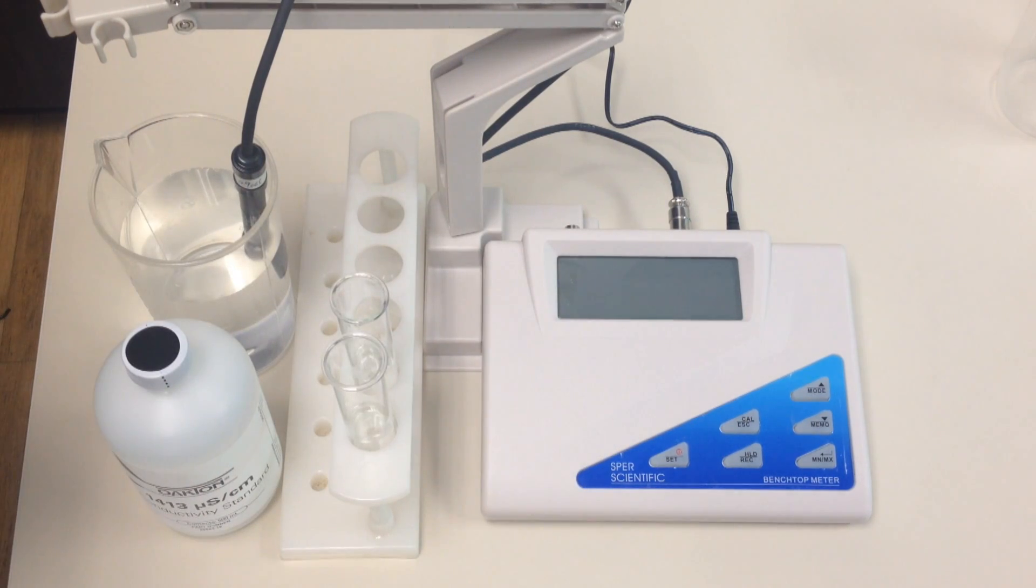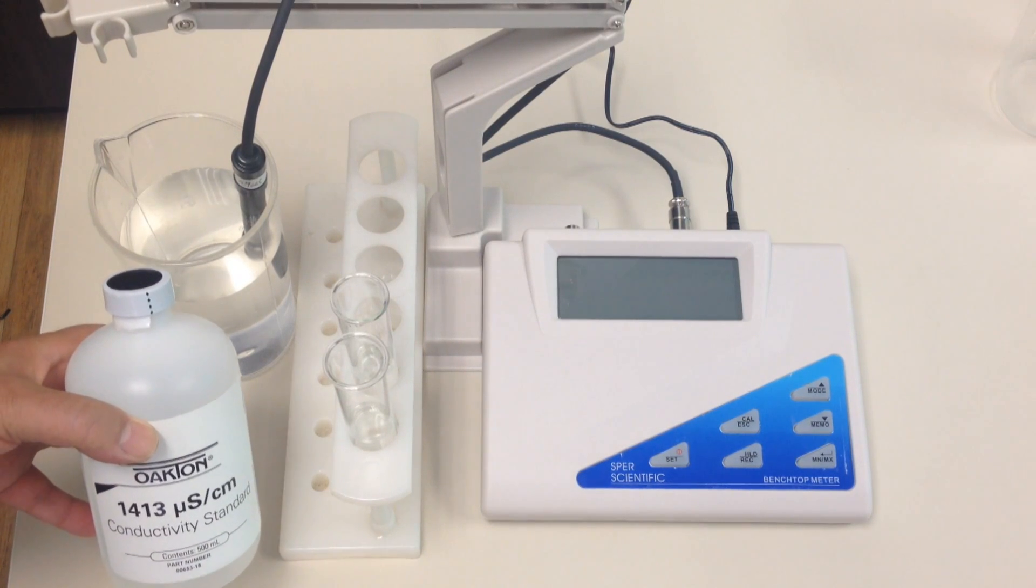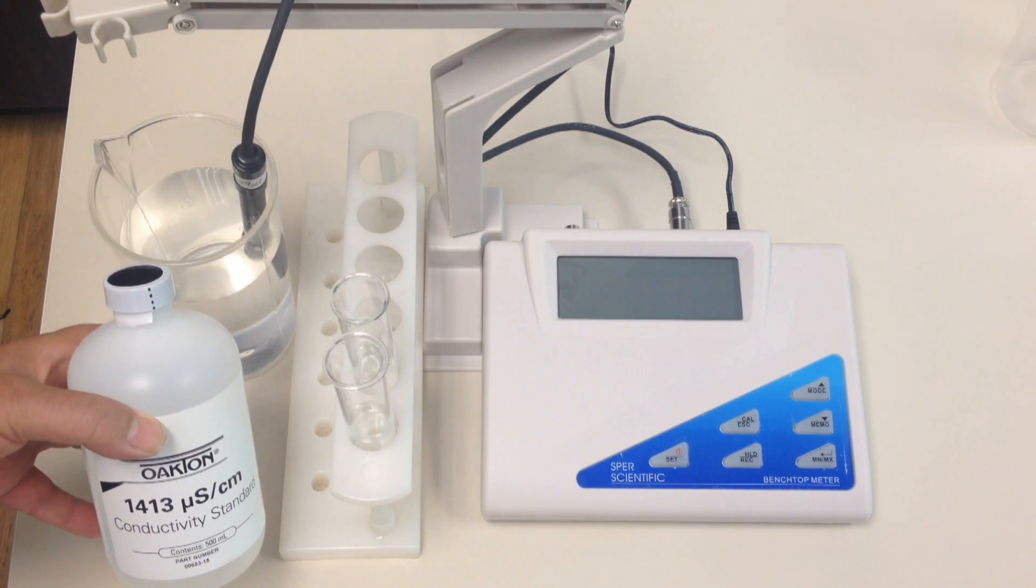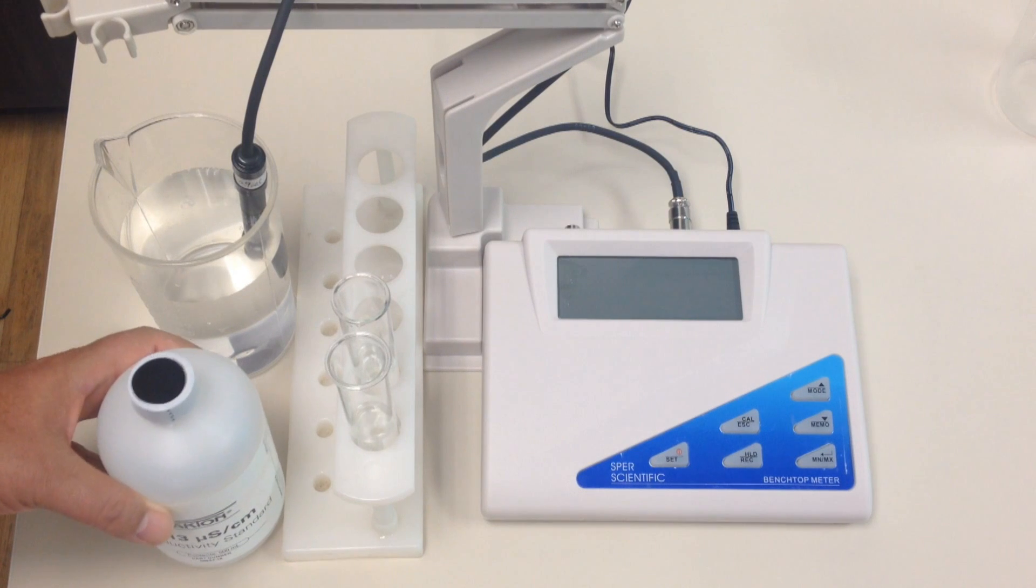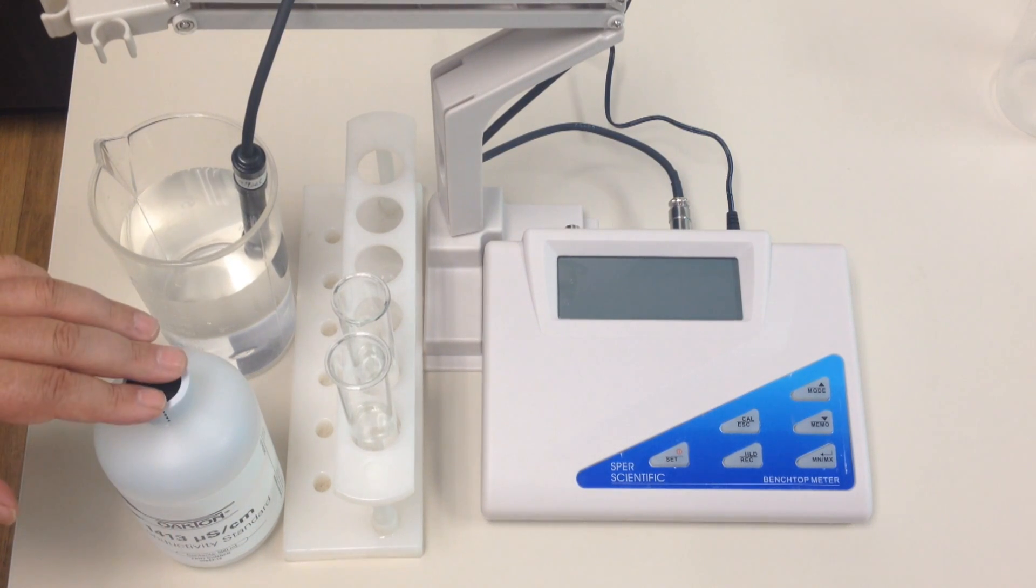Now this unit does five different ranges, and they're found on page 31 of your manual as well. So today we're going to be doing range 3, so the calibration solution that we're going to be using is 1413. So that's important information for you to know. We also are using the two beaker solution as is recommended in the manual.